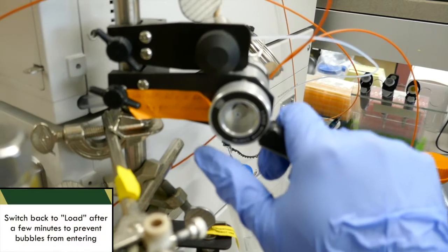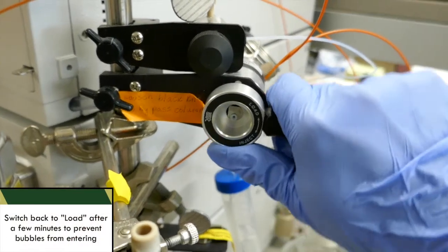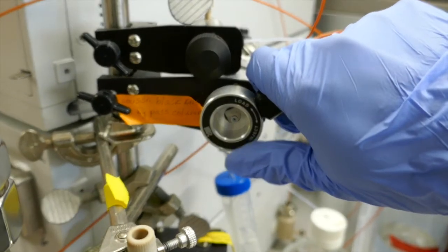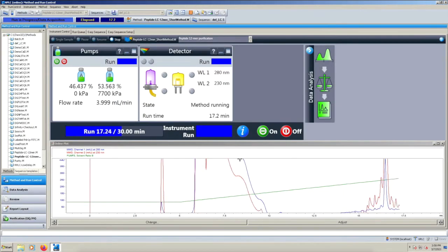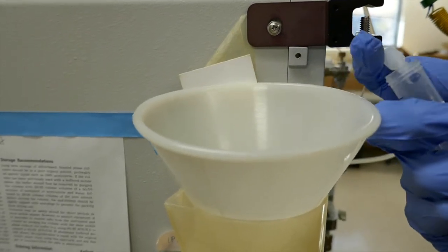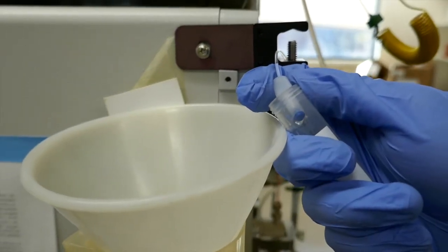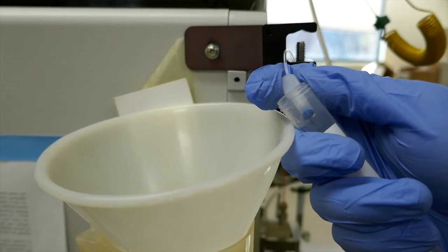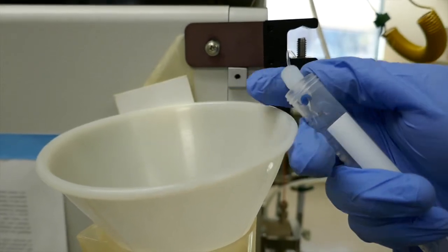Make sure that you switch the injection valve back to the load position after a few minutes to prevent any bubbles from entering the system. Now we're going to let the run continue, and what we're looking for is a 280 peak that represents the protein that we're looking for. Once you get that, you can move the output valve to a tube so that you can collect that sample and allow the run to finish out.